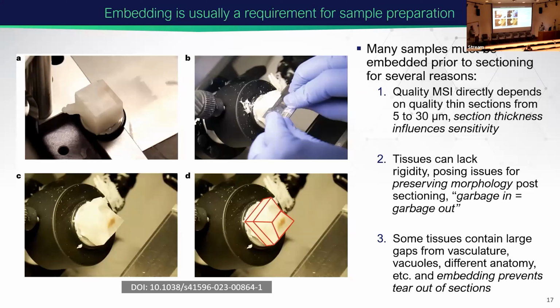But the main thing I want to highlight here is that we want to preserve the morphology of the sample, but also what is really important is that your sample prep depends on your application and what kind of molecules you want to see. So it will not be the same sample prep for this sectioning part. It will be the same if you want to analyze metabolites, proteins, and so on. But downstream, we will not go into downstream preparation. Kevin hints at something there, but we can also talk about that. So you need to also think about future application.